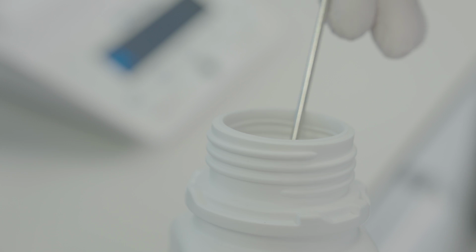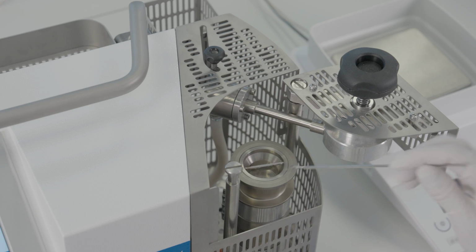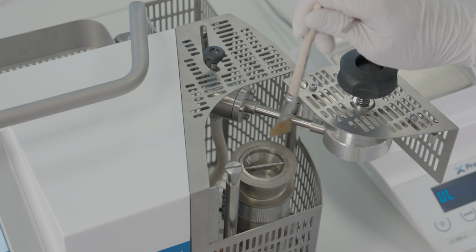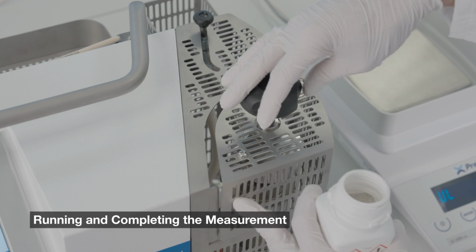Add a dosing spoonful of calcium hydride into the reagent insert. Use the brush to clean the sealing surface. Close the measuring chamber.